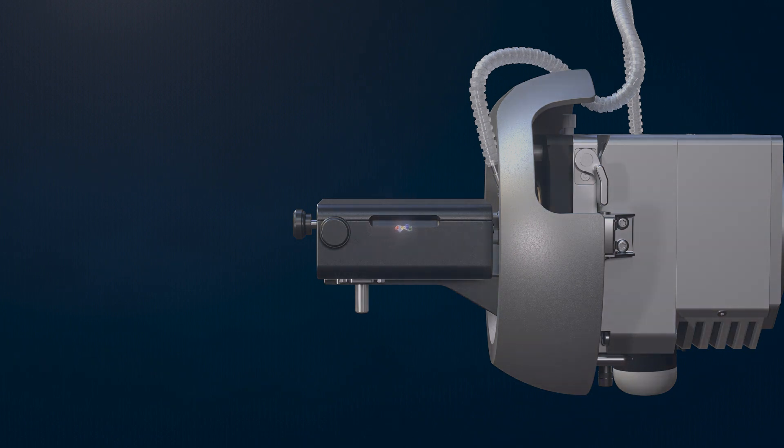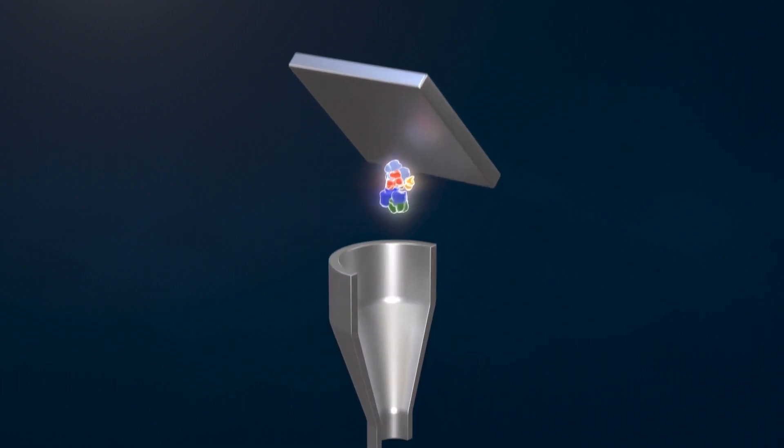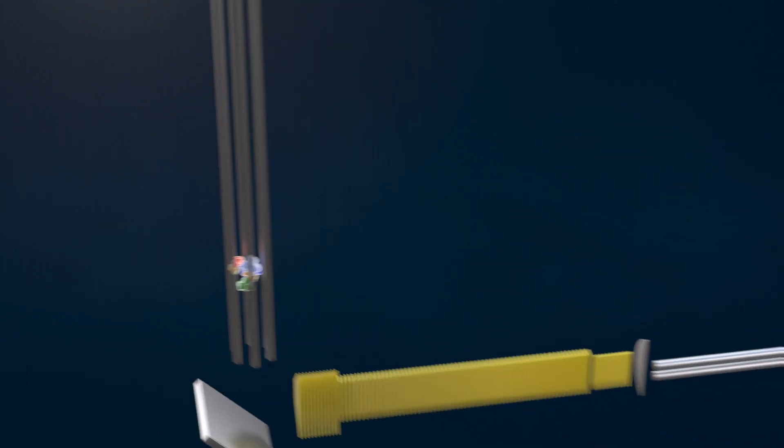After ionization, the peptides move into the TIMSS-TOF Ultra, where they are first deflected to remove contamination before they reach the TIMSS tunnel.